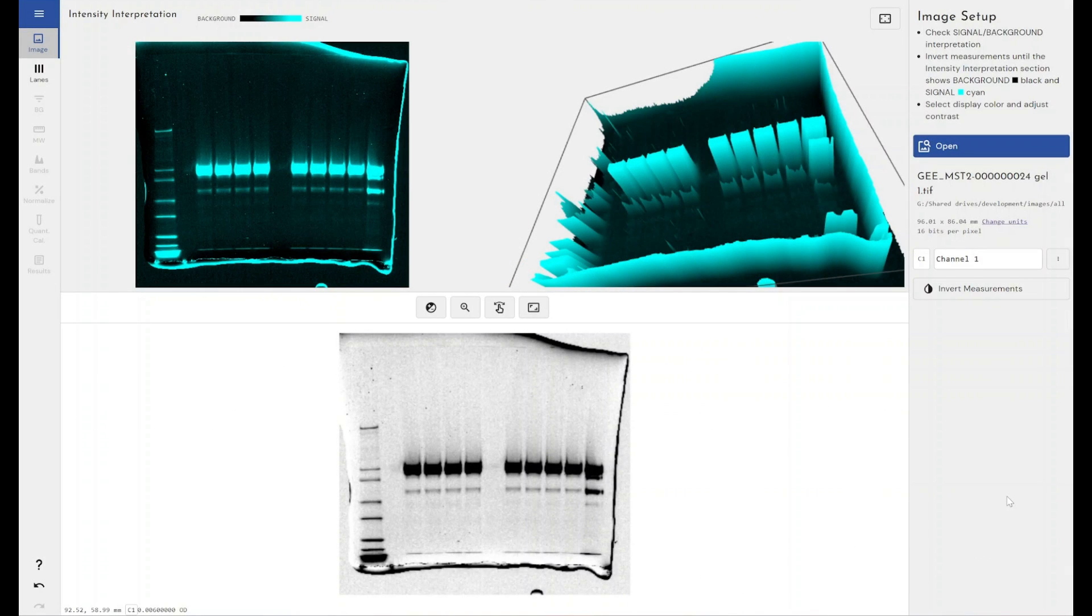Hello everyone. So today I'm going to be showing you how we can use Phoretix 1D to automatically calculate the RF value for the bands within our gel or blot image.